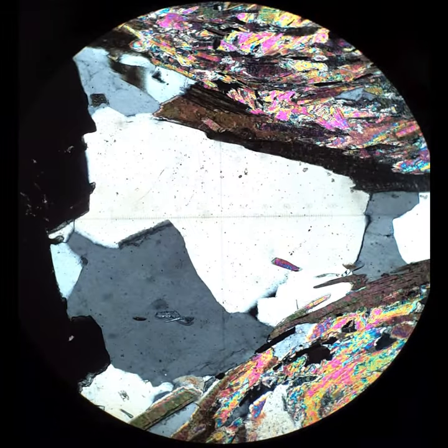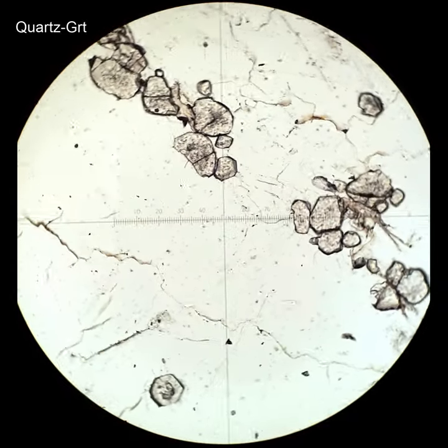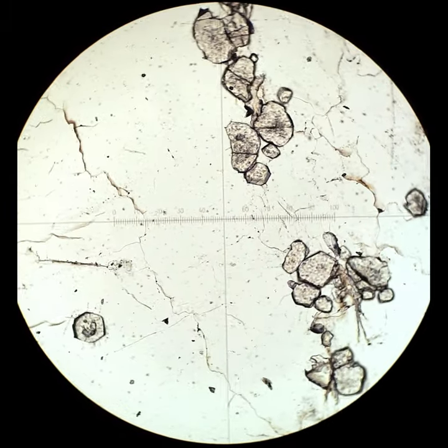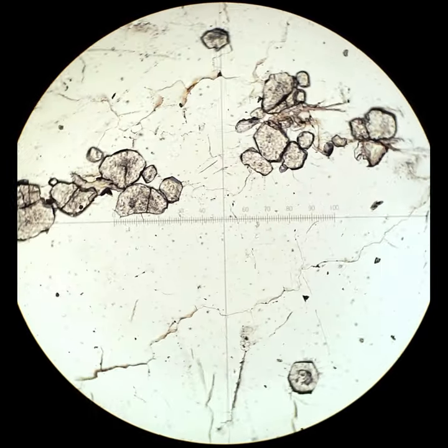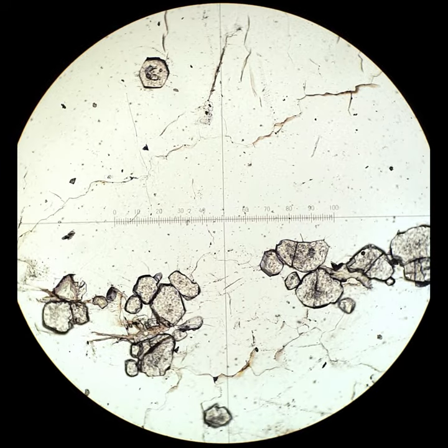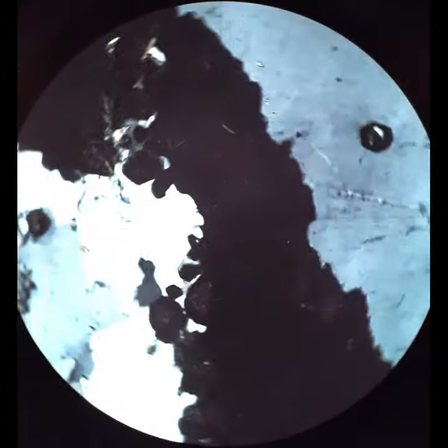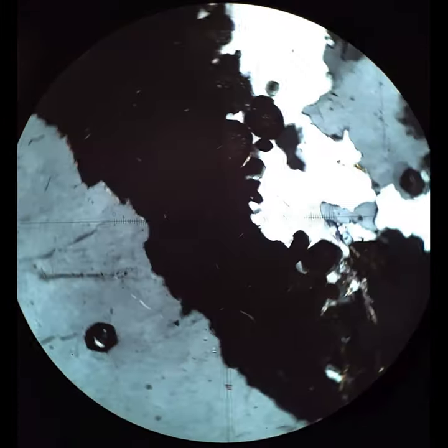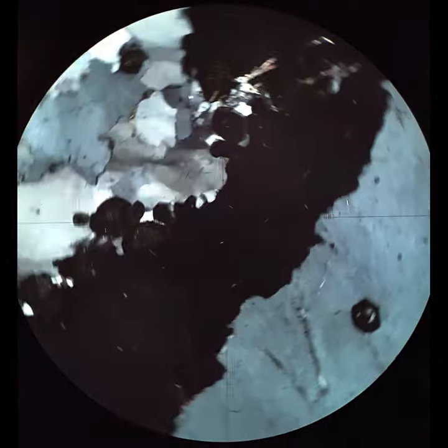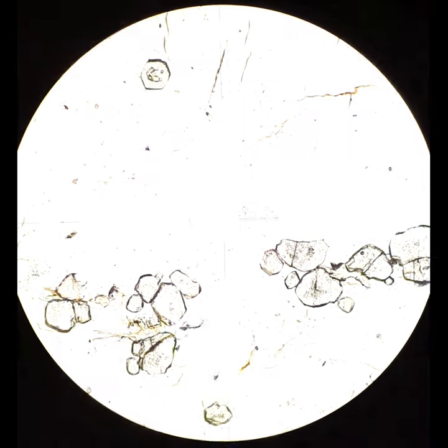It may be slightly yellowish because the thin section could be just a little bit too thick. This is quartz from a garnet quartzite — I had to search through a lot of thin sections before I found one that shows these optical characteristics. When you cross the polars, this quartz looks almost completely black, isotropic, and that's because this particular grain has its c-axis pointing almost perpendicularly up out of the thin section. So the thin section cuts a nearly perfect circular cross section through the uniaxial optical indicatrix of this grain. The other ones are much more typical — black and white.